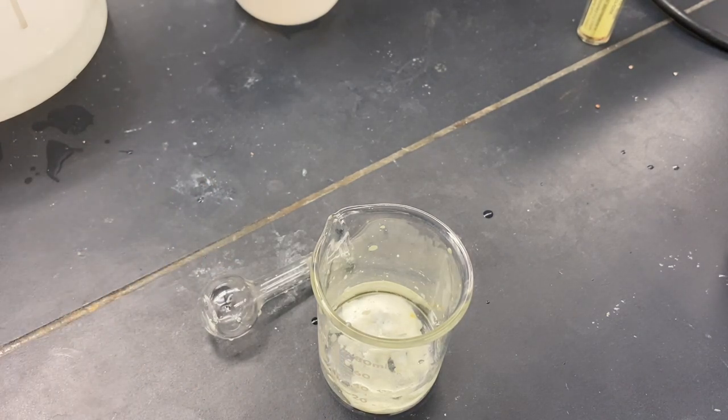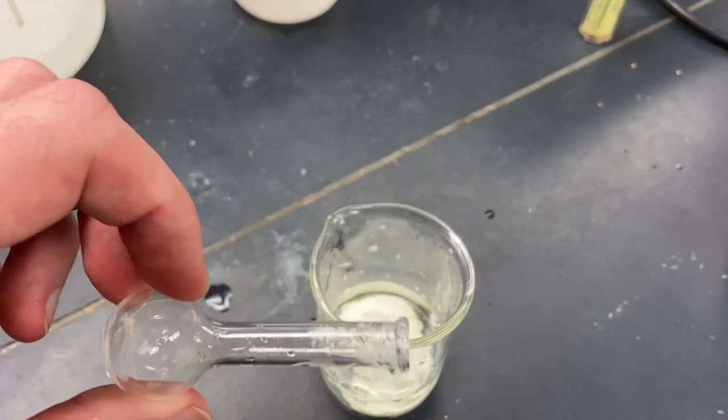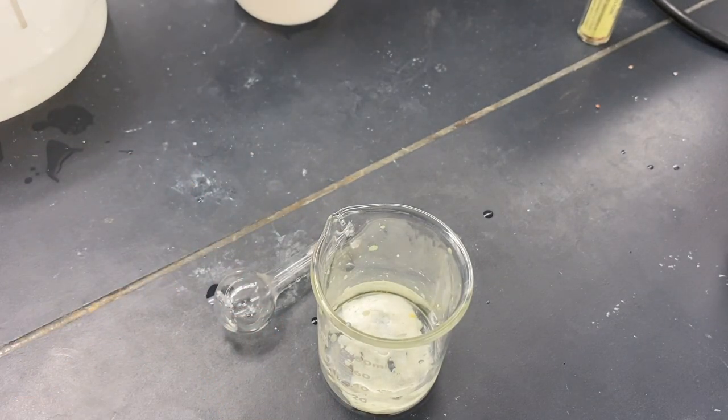With some additional cold deionized water. And we'll be able to get that out of our flask. We'll use the additional water to get this out of here. We'll use some water to wash it out of that. Just to make sure we get everything into our Buchner funnel.